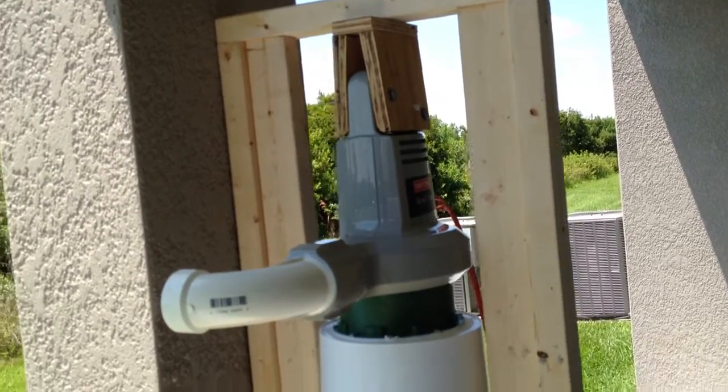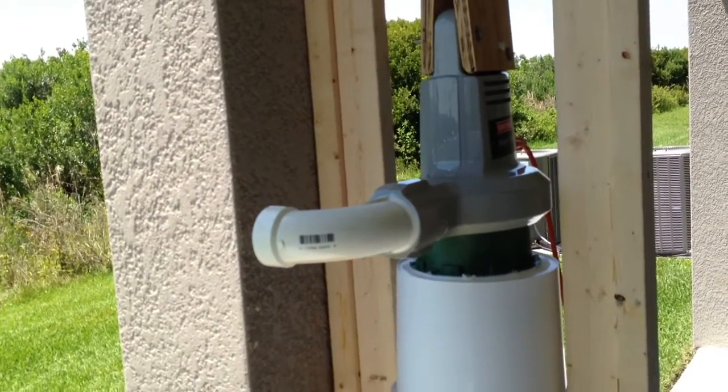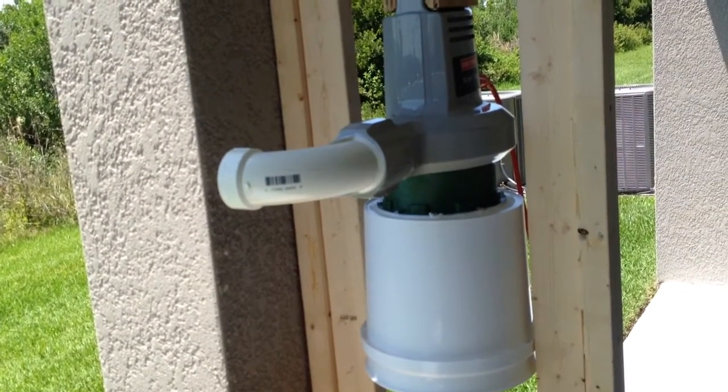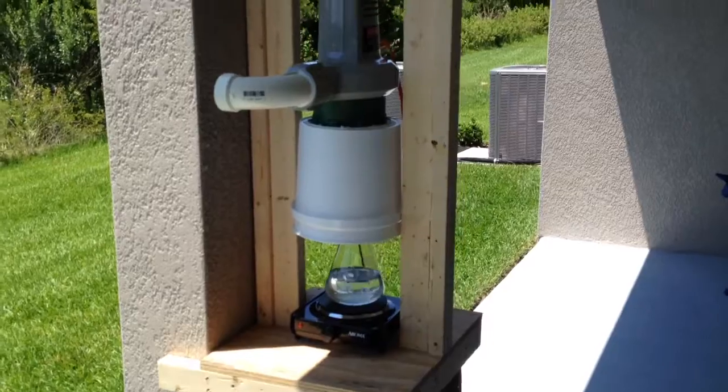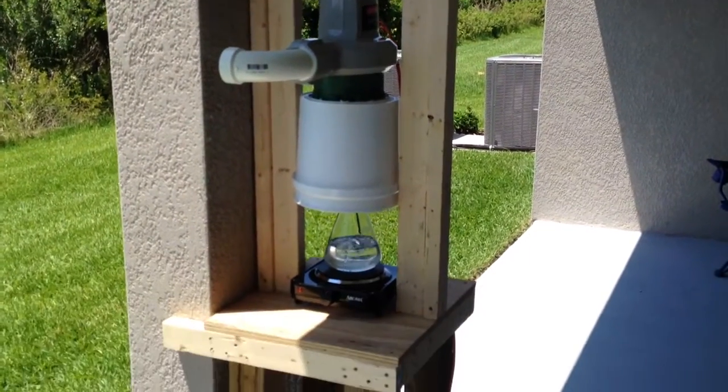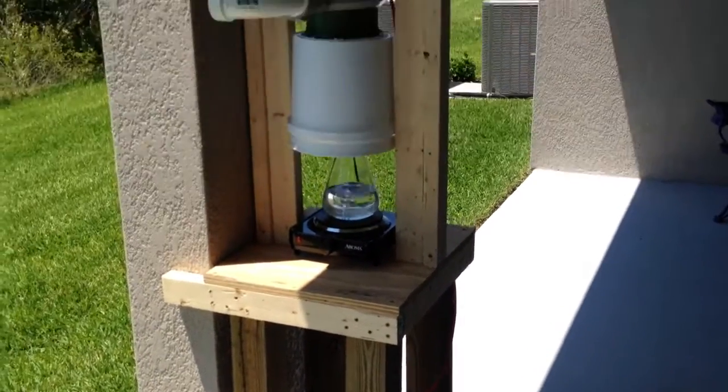So if all goes well, I'm going to finish this over the weekend and I'll start doing my first refining batch come Monday. I hope you guys get some good ideas on this. If you have some suggestions or critiques, I appreciate hearing them.